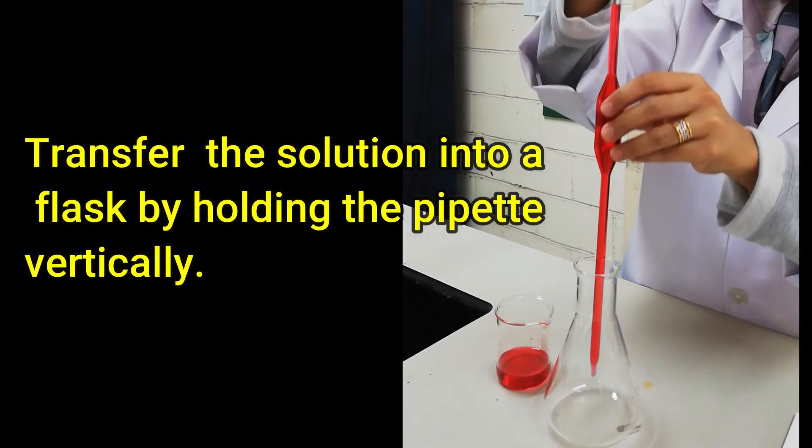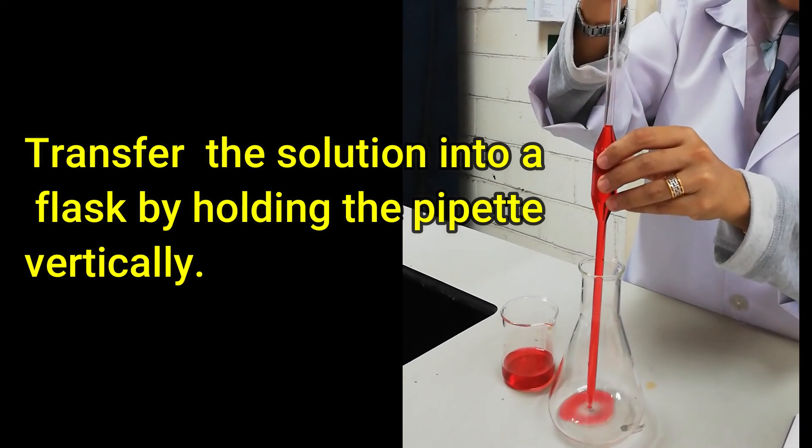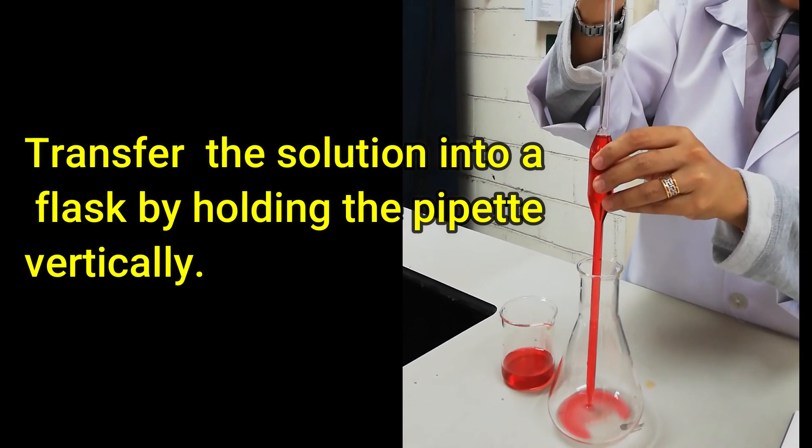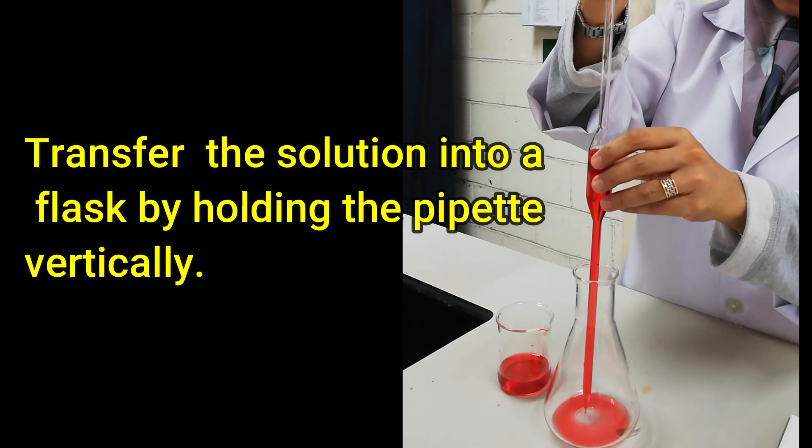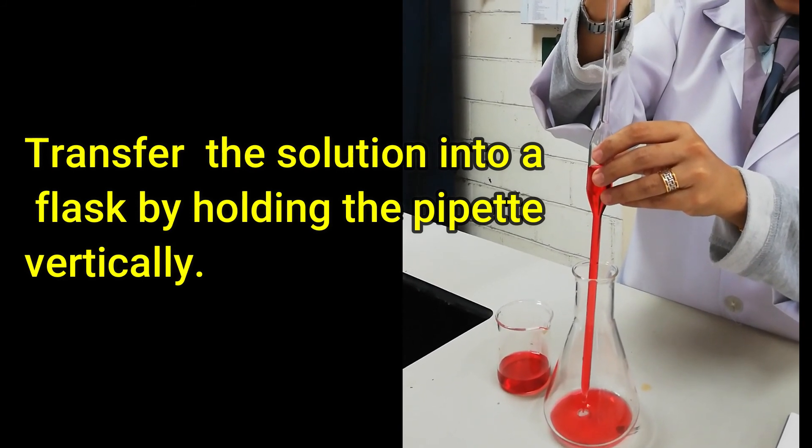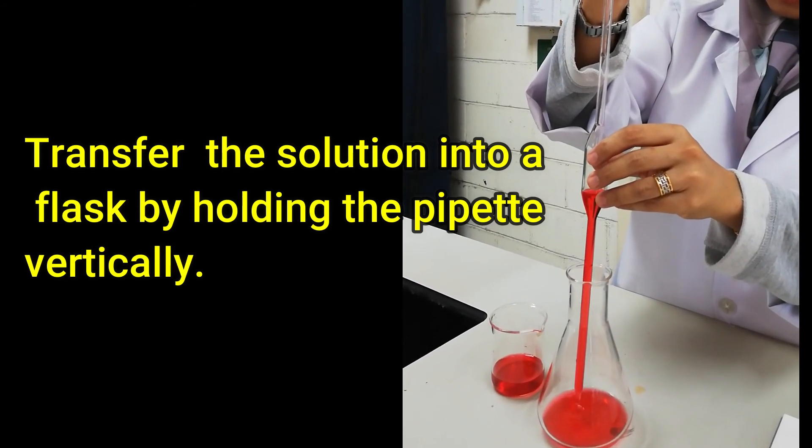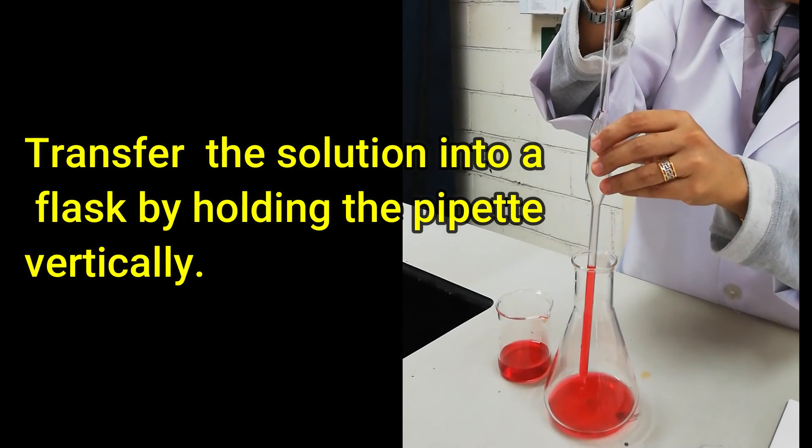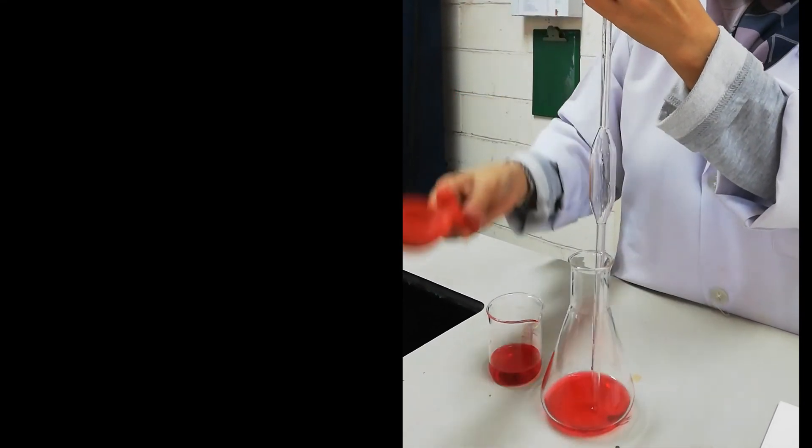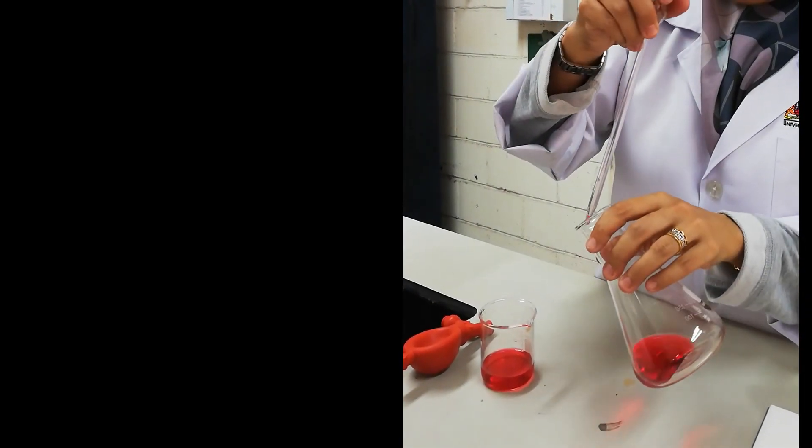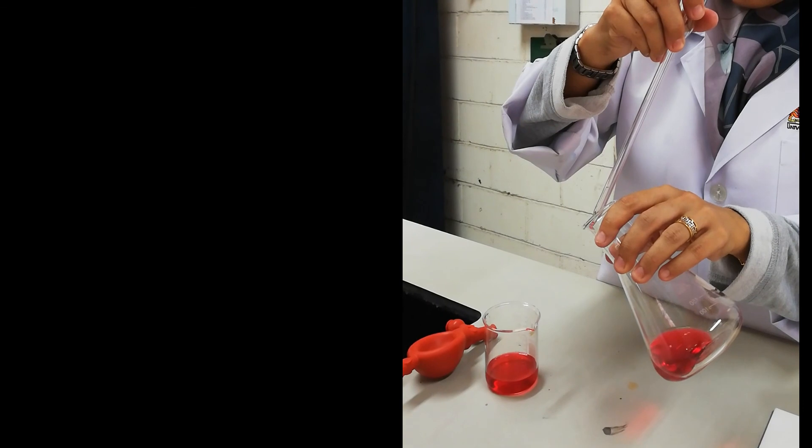Transfer the solution into a receiving flask by holding the pipette vertically and allow the solution to drain. There will be a very small amount of solution that will be left. Do not force this liquid out. Touch the tip of the pipette to the side of the flask to allow the solution to drain.